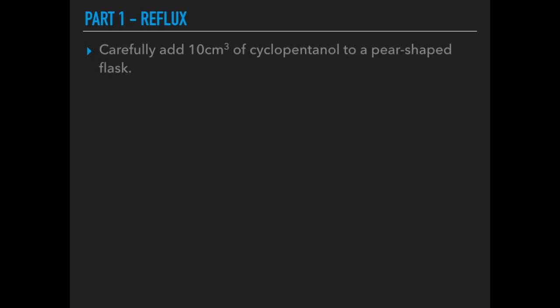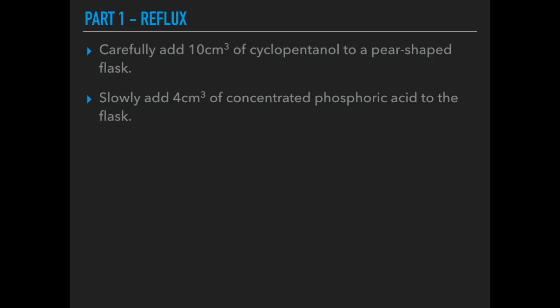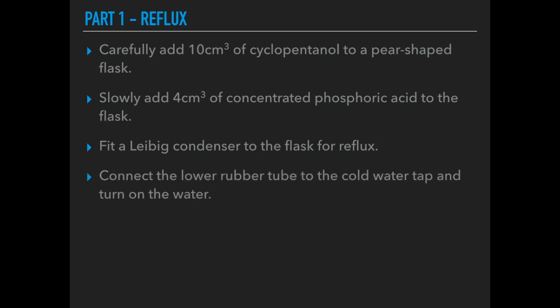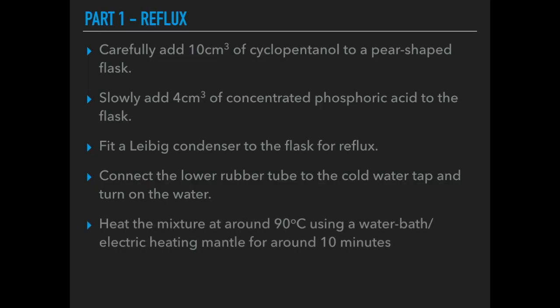Moving on to part one, the reflux step. Carefully add the cyclopentanol to a pear-shaped flask or round-bottom flask, then slowly add the concentrated phosphoric acid to the same flask. Fit a Liebig condenser to the flask for reflux, connect the lower rubber tube to the cold water tap, turn on the water, and heat the mixture to around 90°C using a water bath or electric heating mantle for around 10 minutes.